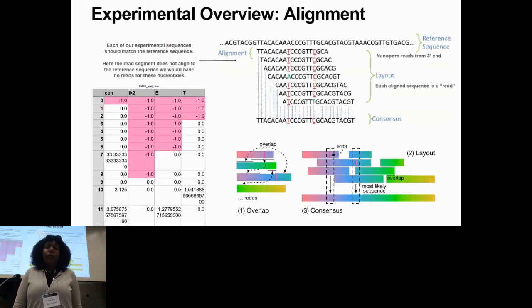So after sequencing the reads, the sequence data is aligned with a reference sequence, which is just the sequence that you're using in your library. In some instances, nucleotides may not be read or the data is not aligned. These are indicated in pink and the negative ones. You'll see this most commonly in the 3' and 5' ends of any direct RNA sequencing for about 5 to 10 nucleotides, as the signal is kind of attuned to the RNA strand. And this varies over the number of RNA you're sequencing, the length of the RNA, and so on and so forth.